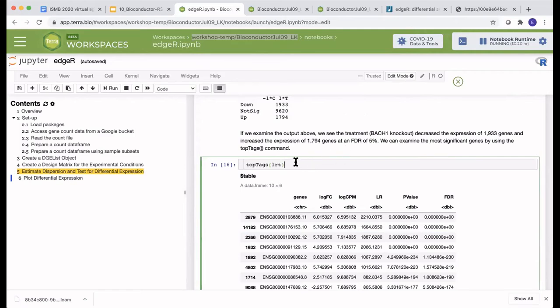I'd have to look it up right now. But once you've created a text file with this output, again, you can use that gsutil command to move it from your virtual machine to, say, your Workspace Google bucket. And I could show you an example of that if you would like.